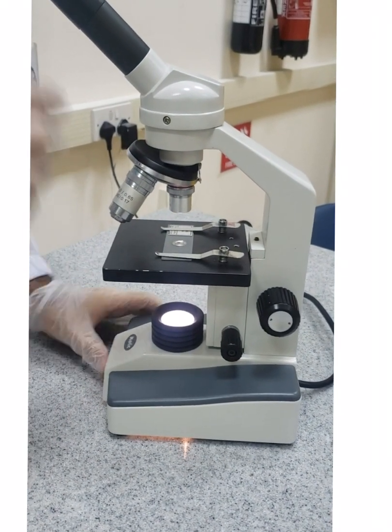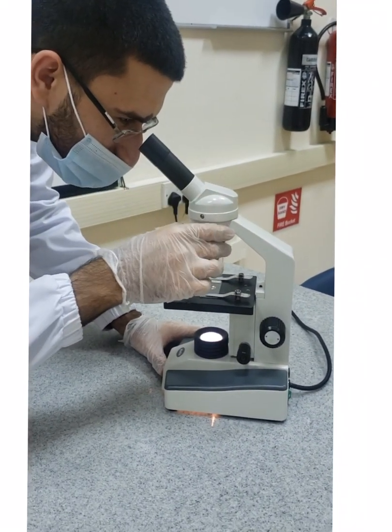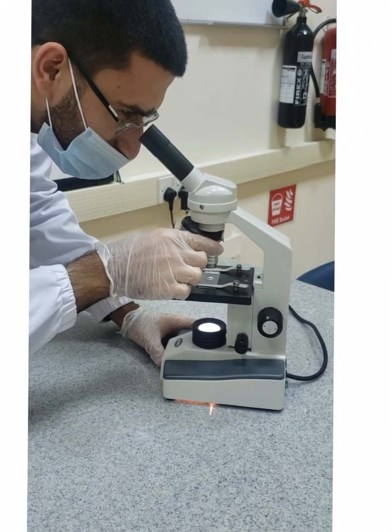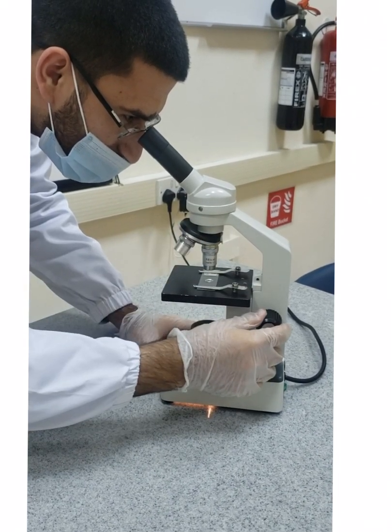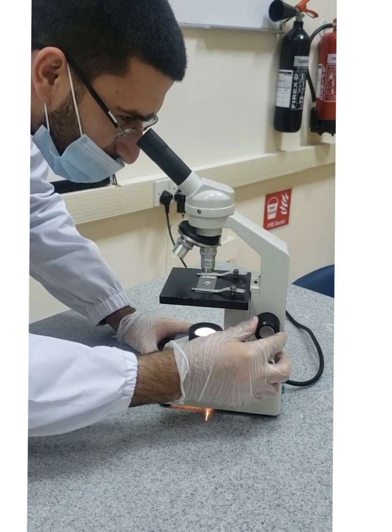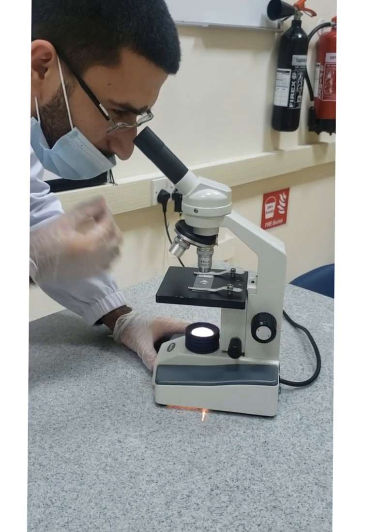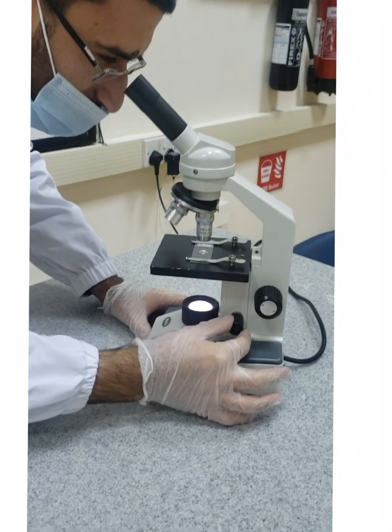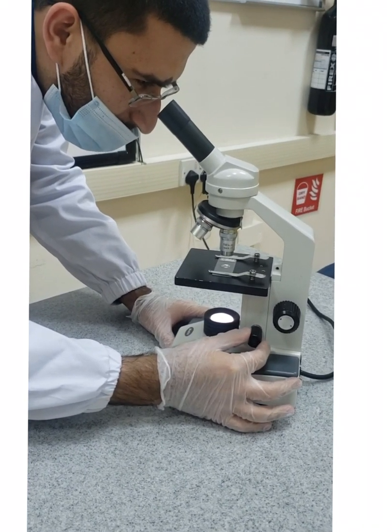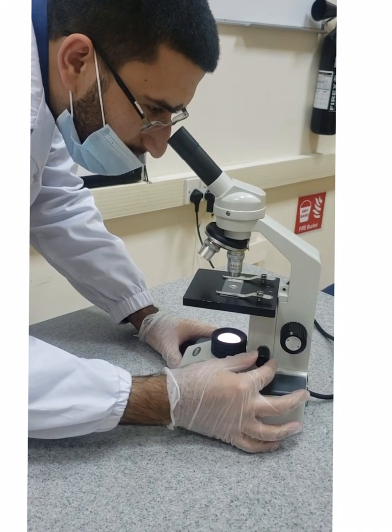You can put now your eye on the eyepiece. Okay, I'm gonna use a bigger objective. Okay, now use guys the coarse adjustment to take the stage and focus the picture. When you focus the picture, now you can use the fine adjustment to make the image clearer. Okay, and that's it.